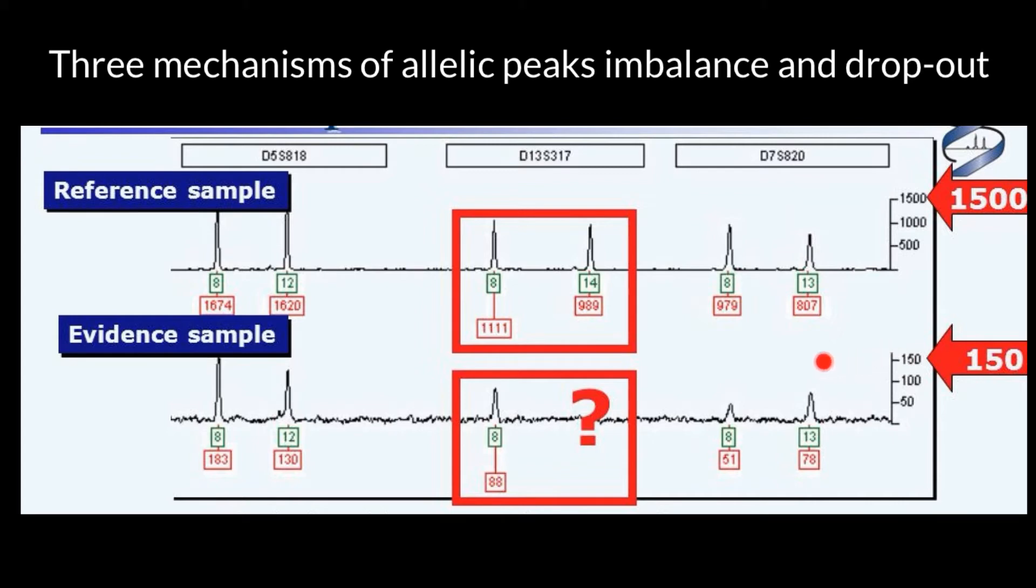And normally we do not analyze such peaks at all because everything below 150 relative fluorescent units usually is a threshold for our analysis. And this would be considered just noise. But when we take samples from a crime scene, it is very common that quantities would be just minute quantities. And we still have to analyze such electropherograms.